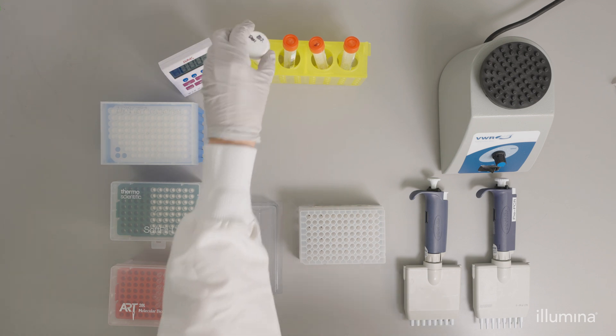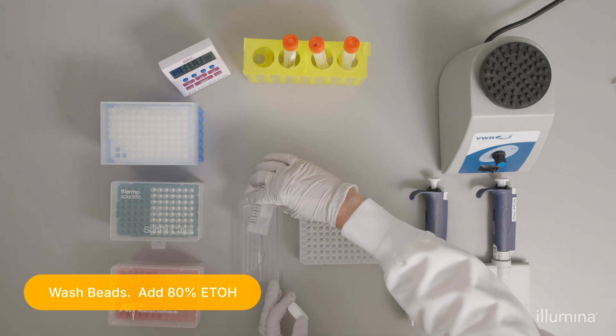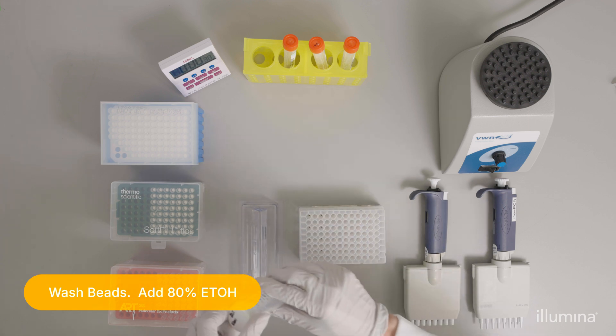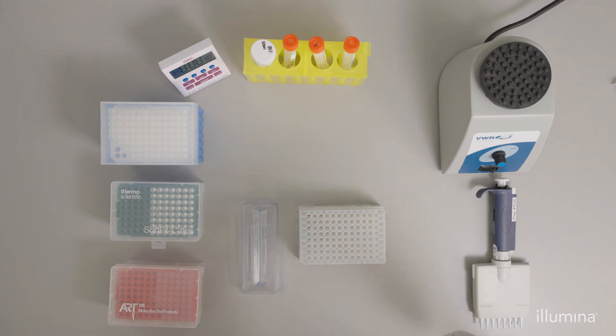To wash beads, keep the MIDI plate on the magnetic stand. Add freshly made 80% ethanol to a new trough and add appropriate volume to each sample well of the MIDI plate using a 200 microliter multi-channel pipette.